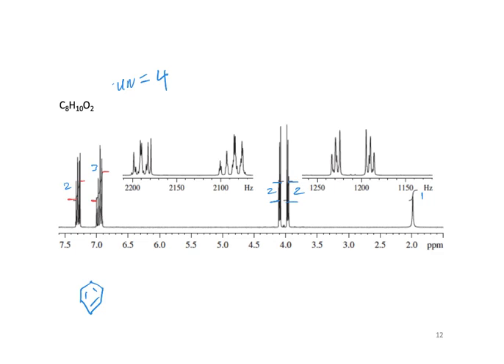Right. Okay, so how many substituents do we have on the benzene ring? Looks like 2? No. It's 2 to 3. How many protons are on the benzene ring? 6. And 5. 5 from the integration, so yeah, then there's one substituent.